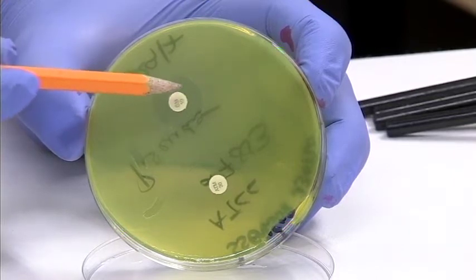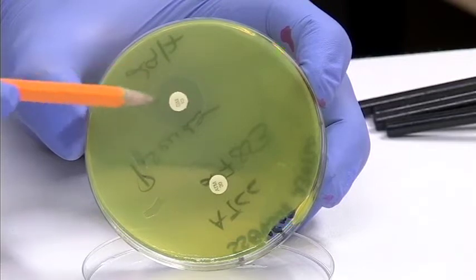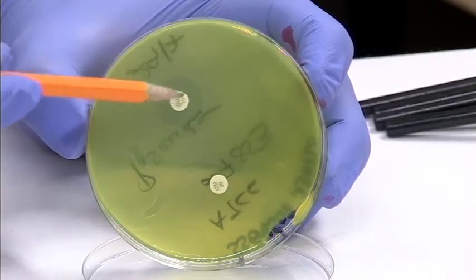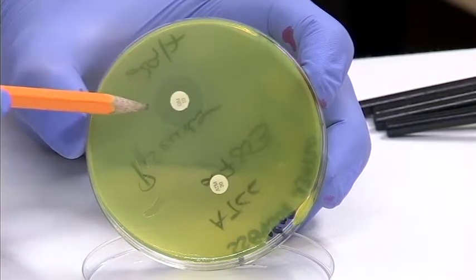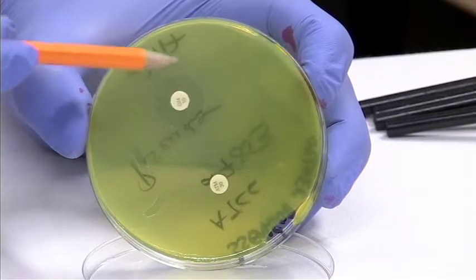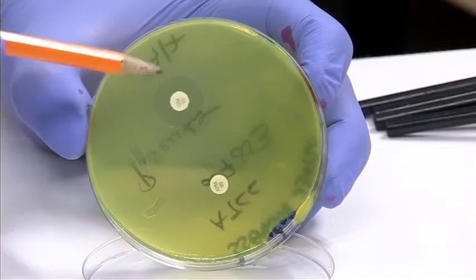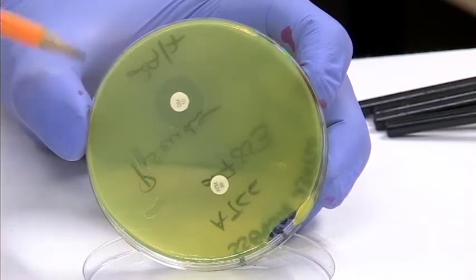At some point, you'll see a line or circle or zone created where no bacterial growth occurs. So the drug would have been diffusing outwards, trying to kill the bacteria, and when at some point it stops killing, you'll have the bacteria growing on the outside. This is called a zone of inhibition, which we measure with a ruler and compare to a standard or reference chart to determine whether it's sensitive, intermediate, or resistant.